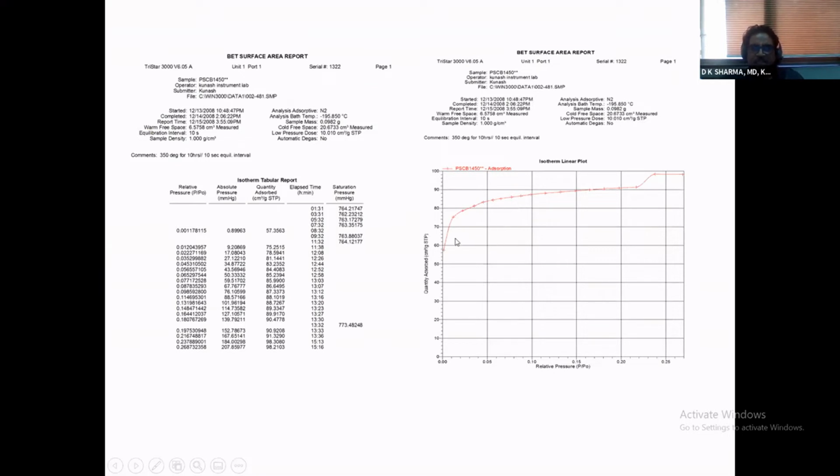In this slide, can you see this graph with the red pen? Can all of you see this? Yes, sir. Okay. This is unequilibrated data, deliberately acquired unequilibrated data. Next point, this point that you see from here to here was equilibrated, which means if I were to equilibrate all the data, the isotherm should have looked like this, not this.